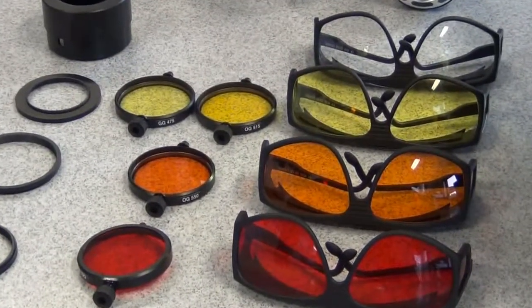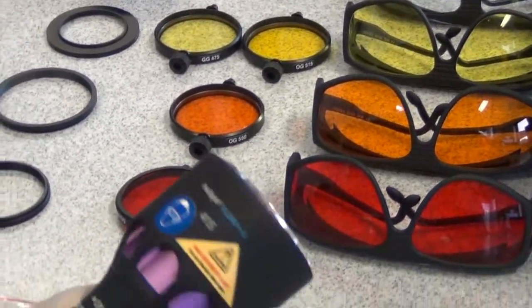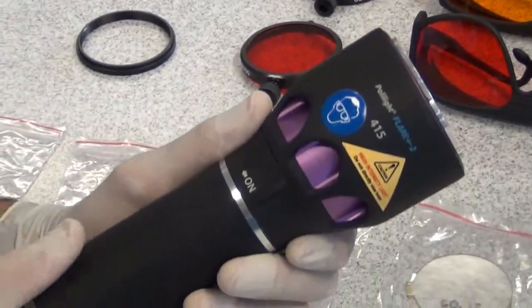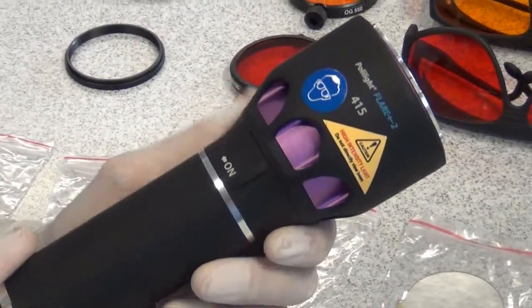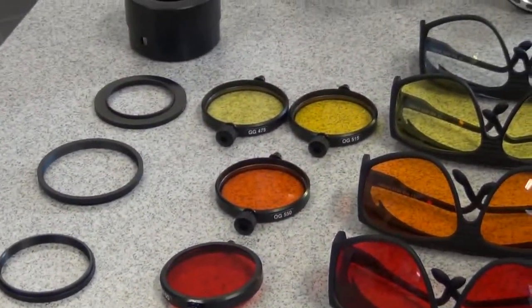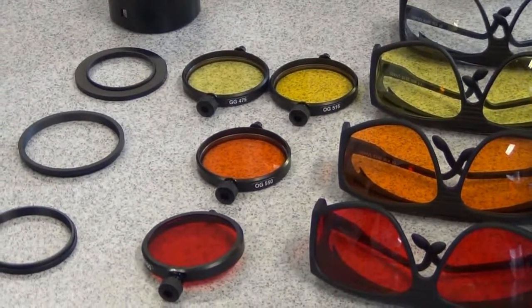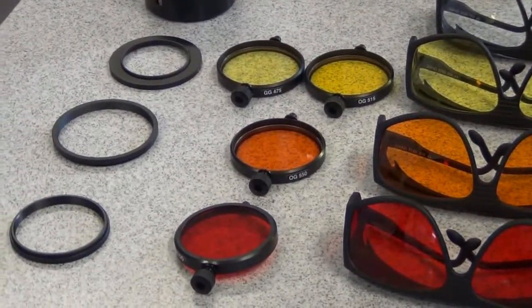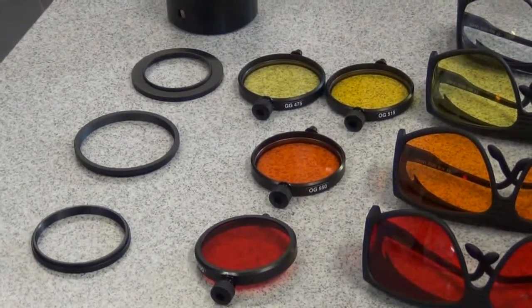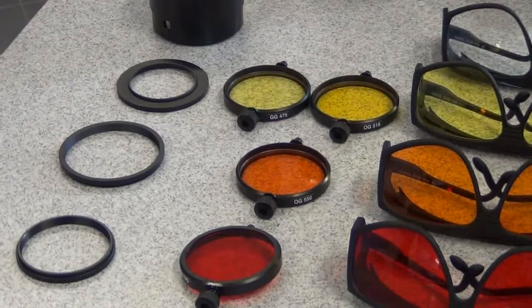When you use high frequency light sources, like in this case this 415 violet light. Another high frequency light that you would use quite often would be a 450 light source. The round filters that you see there are barrier filters that are placed inside a filter adapter, and they correspond with a searching goggle that the field workers use during the searching.